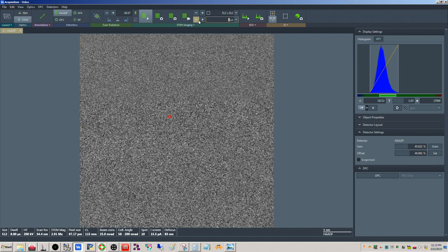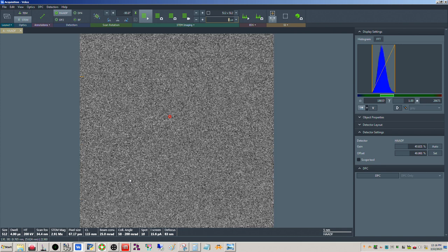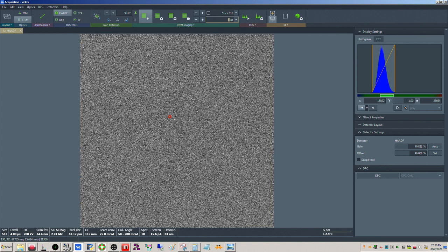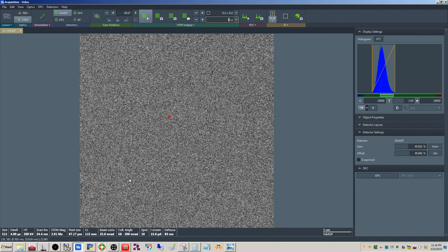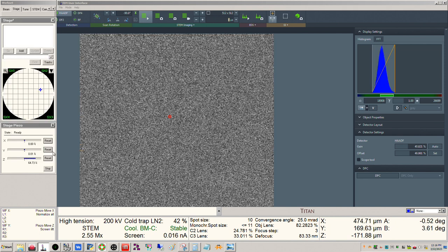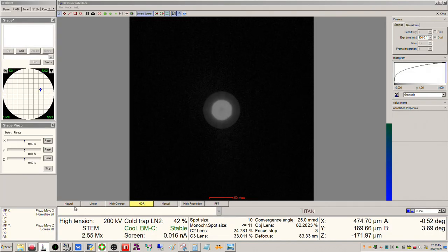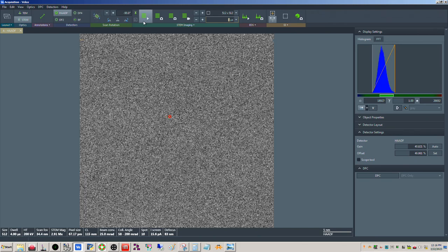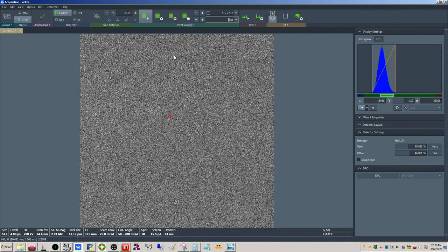Okay, and now I can actually use my piezo stage. I've got MFY set to piezo Z. So I can use this to dial in and get my atomic resolution here. Let me see here. Stage approaching end. Okay, so let's reset. All right, let me freeze this and take a look here. Let me switch to natural. Okay, so we're a little far. There we go. I'm adjusting coarse Z now. Okay, so let's go back here. There we go. I can kind of see it right there.